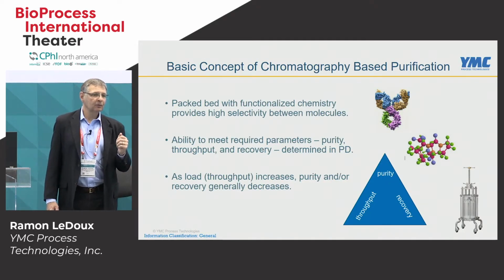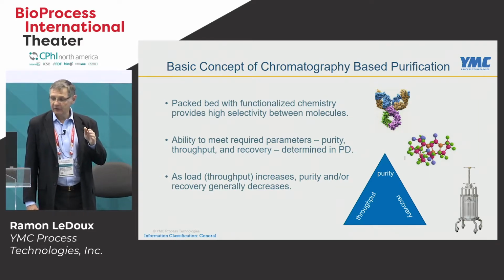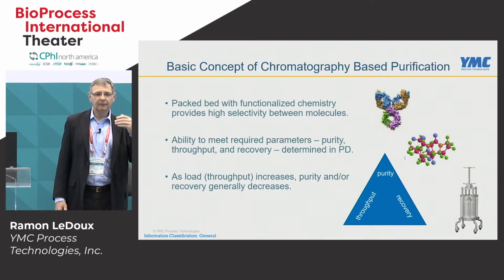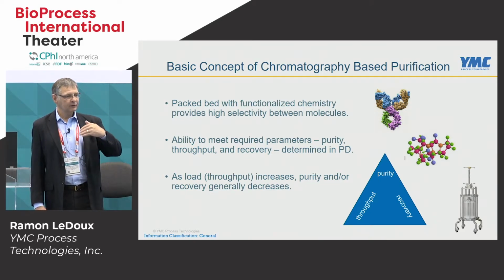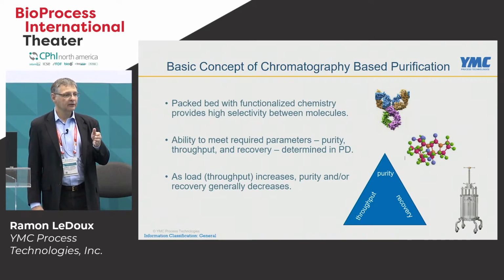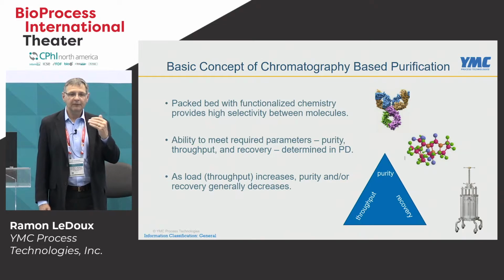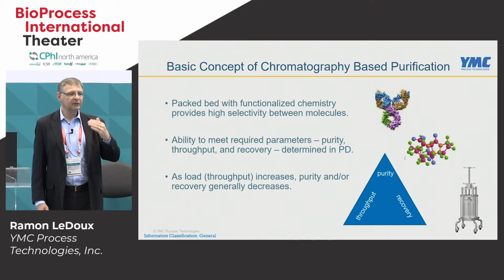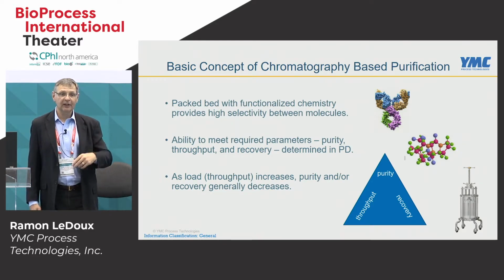So if we look at traditional chromatography, the bugaboo has always been about managing or balancing the difference between purity, throughput, and recovery. If purity is your standard, typically, if you want high recoveries, your throughputs suffer, right? In chromatographic terms, overloading the column reduces my resolution inherently. So if I need high recoveries, I can put less on the column so my throughput drops. If I need high throughput, then very often my recoveries will drop because I'll have to take smaller fractions. So what we're going to try to do is come up with a strategy that allows us to decouple purity and recovery so that we can obtain both.